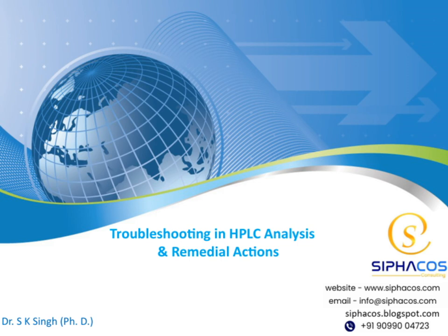Today, we will be discussing troubleshooting in HPLC analysis and remedial actions. This is a crucial topic for ensuring accurate and reliable analytical results. Over the course of this presentation, I will walk you through common issues encountered during HPLC analysis and how to effectively address them. So, let's get started and explore how to troubleshoot and resolve challenges in HPLC together.